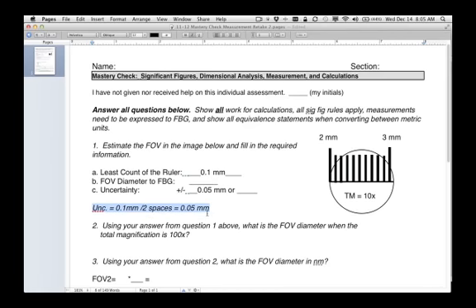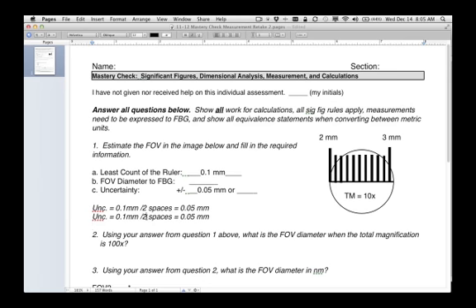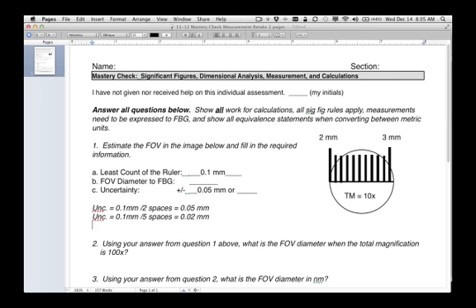Okay, what if we had decided to turn it into 5 spaces? So this least count, divided into 5 spaces, would be 0.1 divided by 5, which is 0.02. And both of those would be fine. So you could have 0.05 or 0.02. I don't think we'd be comfortable dividing that space into 10 equal spaces, and so I don't think that having an uncertainty of 0.01 is really going to be able to be done in this case. Okay, so now that we know our uncertainty, our first best guess of that field of view has to be either a multiple of 0.05 or 0.02.